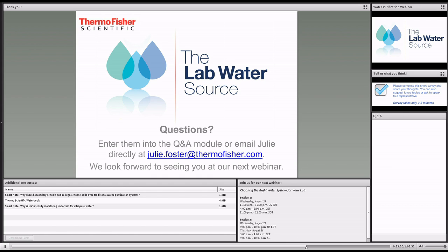EDI still has a rejection stream, so you get waste there. DI cartridges you don't. UV lamps you don't. You get a little bit of waste with an ultrafilter because it's rinsing. So, at the top of the list is distillation. At the bottom of the list probably is DI cartridge.